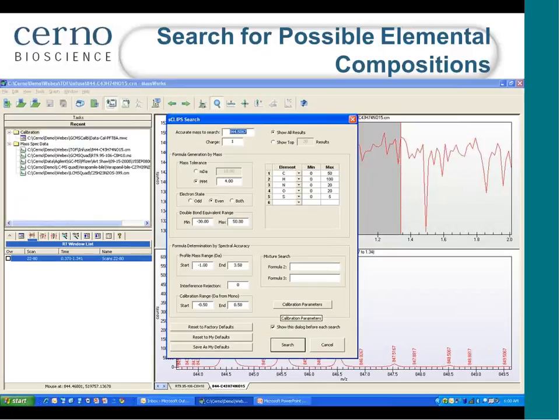So we would punch in the typical suspects, in this particular case, carbon, hydrogen, nitrogen, oxygen. Notice we're not opening up to all possible elements that could make organic compounds, such as fluorine, phosphorus, and so on and so forth here yet. Because of the large mass involved, it would have been overwhelming in terms of possible candidates. So we stick to the basic elements CHNOS, and because it's accurate mass measurements, we would search within plus minus 4 ppm mass accuracy and see what we would get.